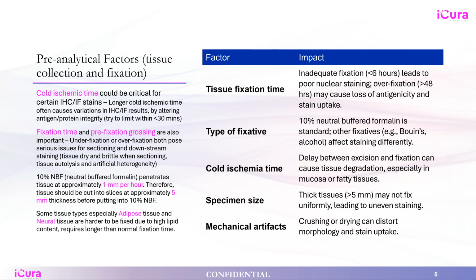And the process of hypoxia or even autolysis starts right away. Some of the biomarkers you're trying to look at in those tissues might also start to disintegrate. So that's why it's very important to put them in fixatives as soon as possible.